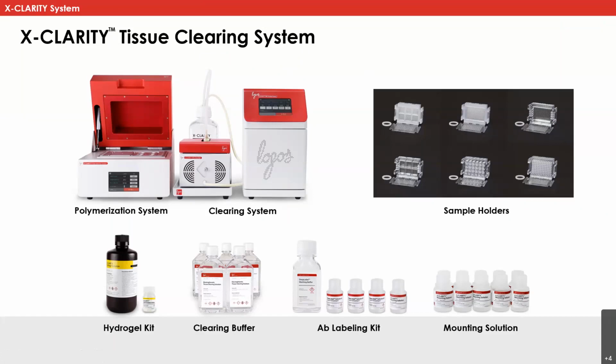the current crosses. When you set this up to run, the buffer will circulate from the reservoir through the system. It's heated, goes into the clearing chamber, and comes back out into the reservoir. Over here on the left-hand side is the polymerization system. Now, this is a pretty sophisticated device that does a very simple thing. As I said, when you are doing the CLARITY-based methods, you need to infuse your samples with hydrogel, which is acrylamide. After these samples are infused with acrylamide, you need to polymerize that so it sets up and retains the structure of the cell.